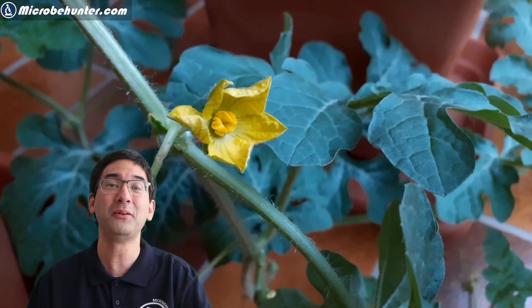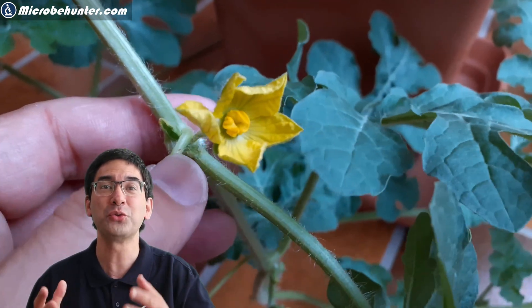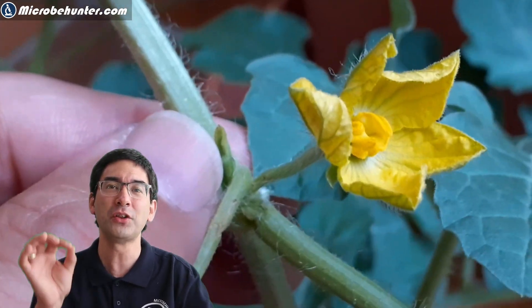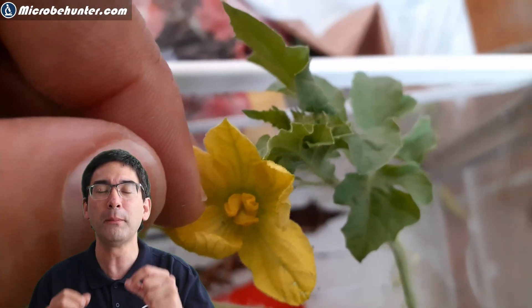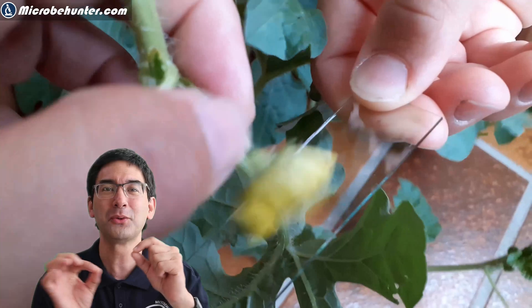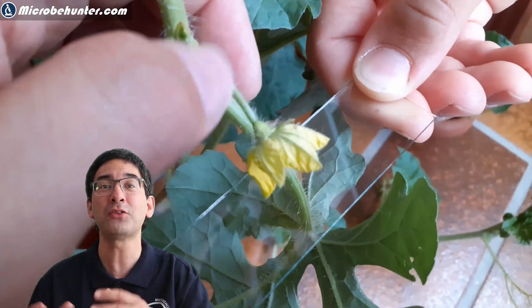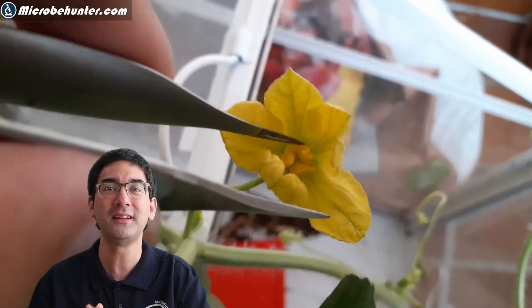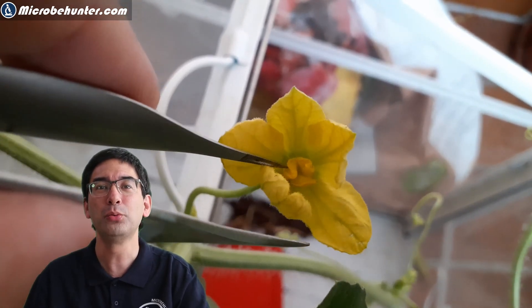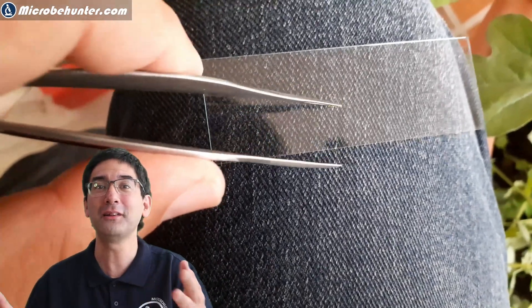I did not want to destroy my children's plant, so I looked for a few flowers. Those flowers contained pollen, and I decided to put the pollen under the microscope. I tried to knock the pollen onto the microscope slide, but they were so sticky that they stayed in the flower. I used tweezers to collect some pollen, tapped them on the slide, added a little water, and put it under the microscope.